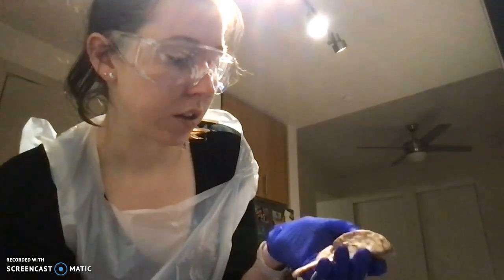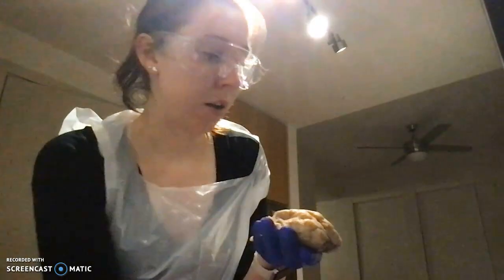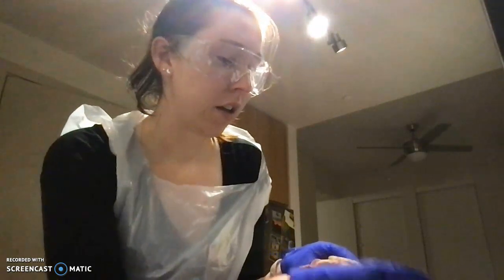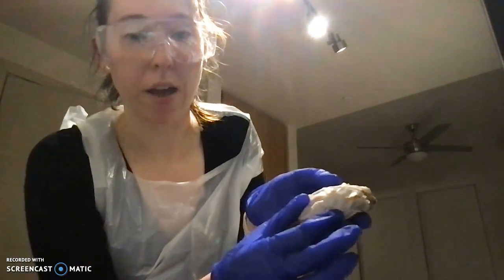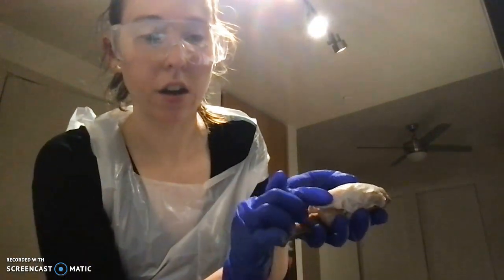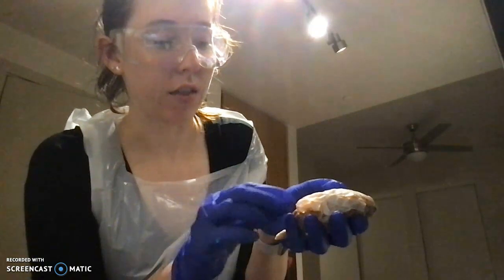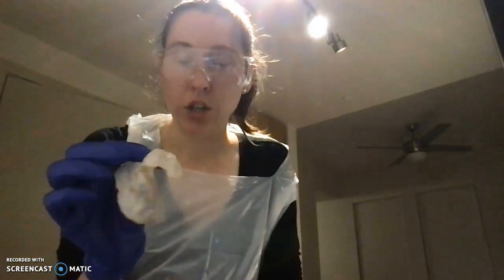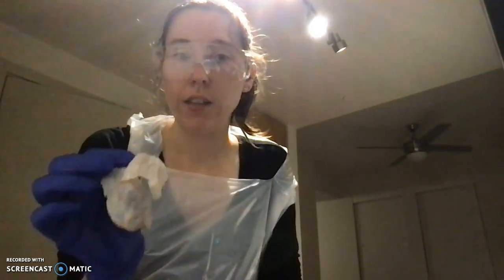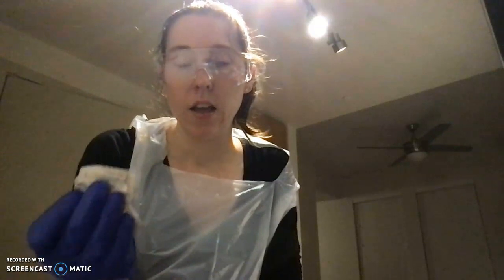So finally, when I got my brain, it was covered kind of like this by this structure here, more fully covered than this, but this cutaway portion is called a meninge, or it's part of the meninges, which is a layer that surrounds the brain and protects it while it's in the skull.